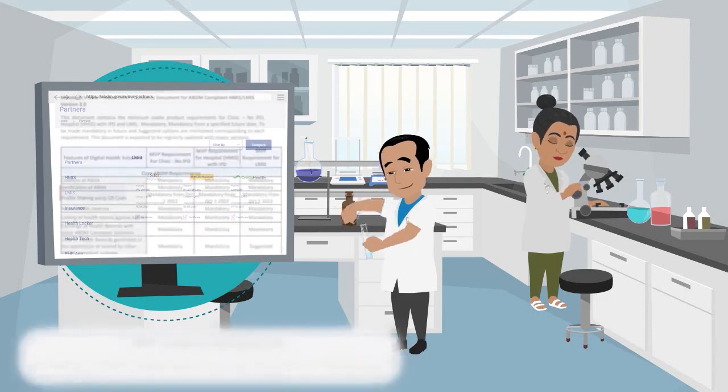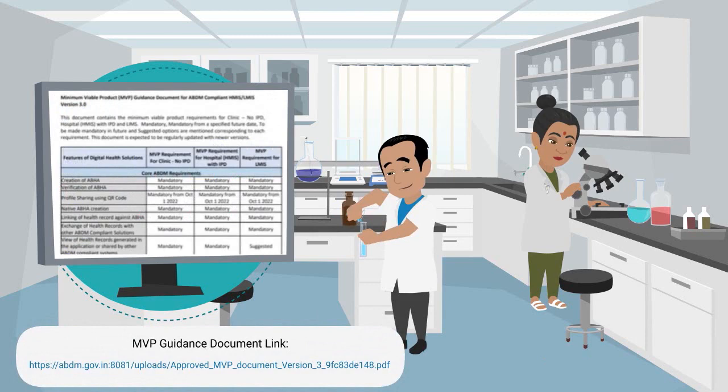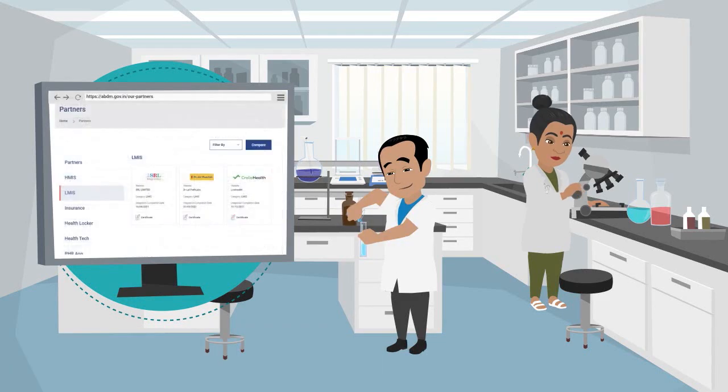They can also investigate Minimum Viable Products MVP guidance document for ABDM-enabled LMIS. Tips for selecting an appropriate LMIS application is explained in the following module. In case the lab is already using an LMIS application, the technical team of facility can reach out to the NHA IT team and get their LMIS ABDM enabled.